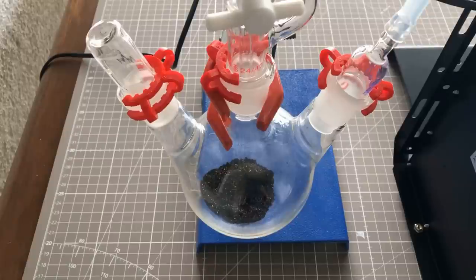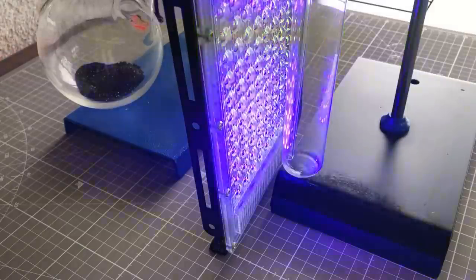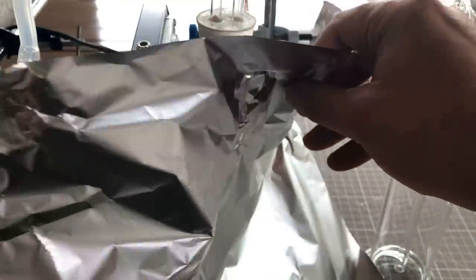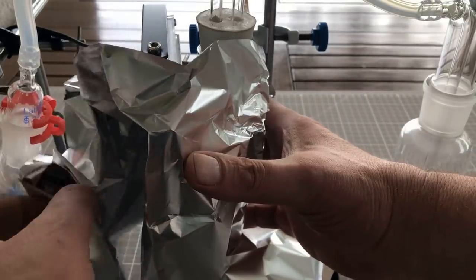The round bottom flask was charged with 20 grams of potassium permanganate. UV light is used instead of a catalyst. The flickering of the LEDs comes from the 50 Hz mains frequency, meaning the LEDs are operated directly on 230 volts mains. A capacitor is used to limit the current of the LEDs. Capacitors work under AC voltage as a frequency dependent resistor.